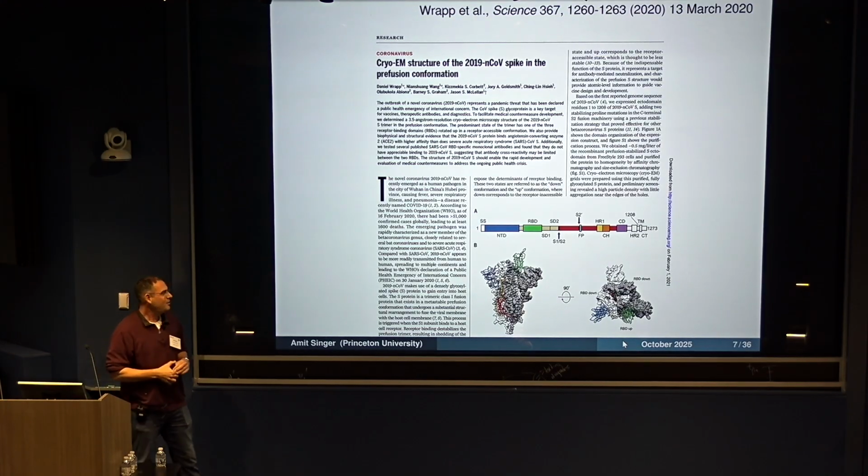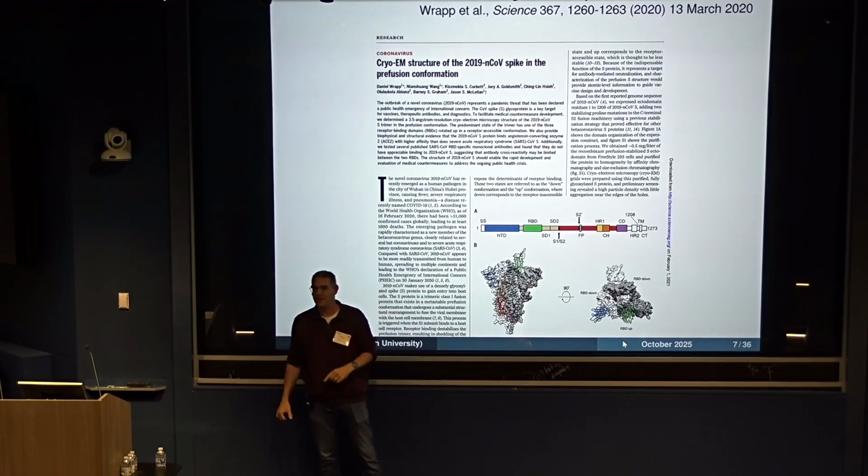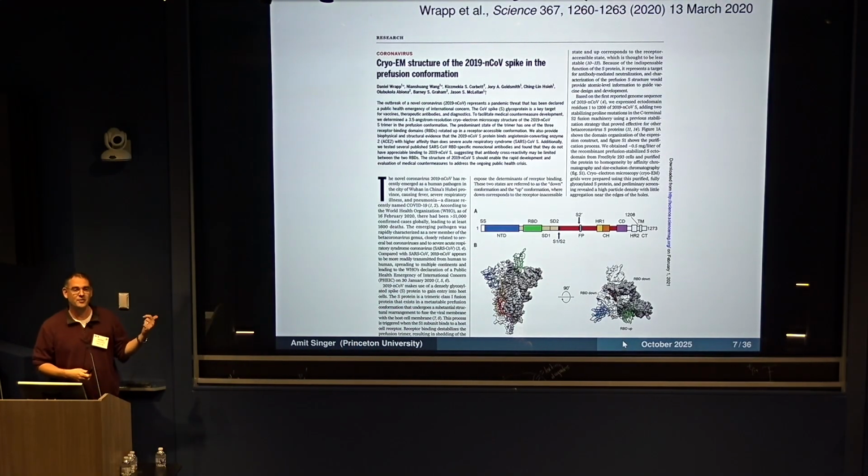And I think many of you recognize this structure because this is the spike protein of the coronavirus. And this was determined very early on in the pandemic. Actually, the structure was determined by cryo-EM, I think maybe a couple of months before March. So once you have the sequence, using cryo-EM, very quickly they're able to determine the structure. And this helped guide vaccine development and therapeutics.